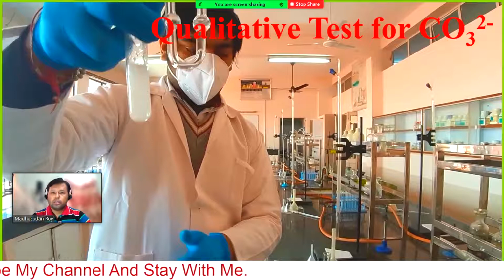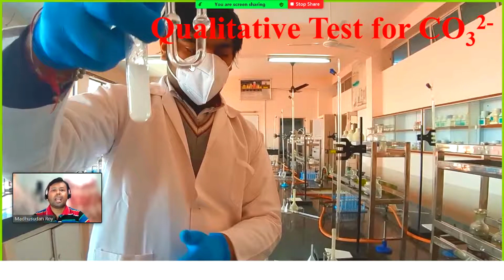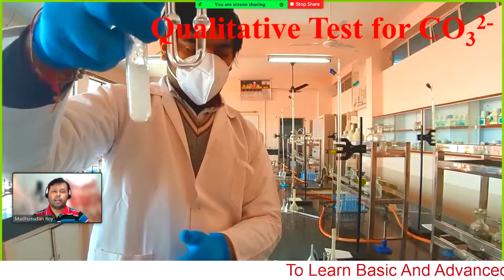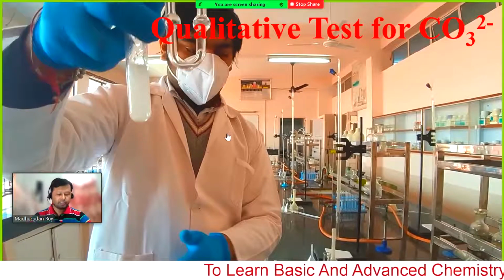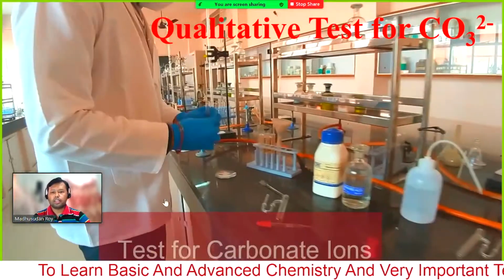We just need to pass a certain amount of carbon dioxide through the lime water to make it turbid. And that is the confirmatory test for carbonate. And we have several other tests. Let's see the other tests. Okay, this is already done.